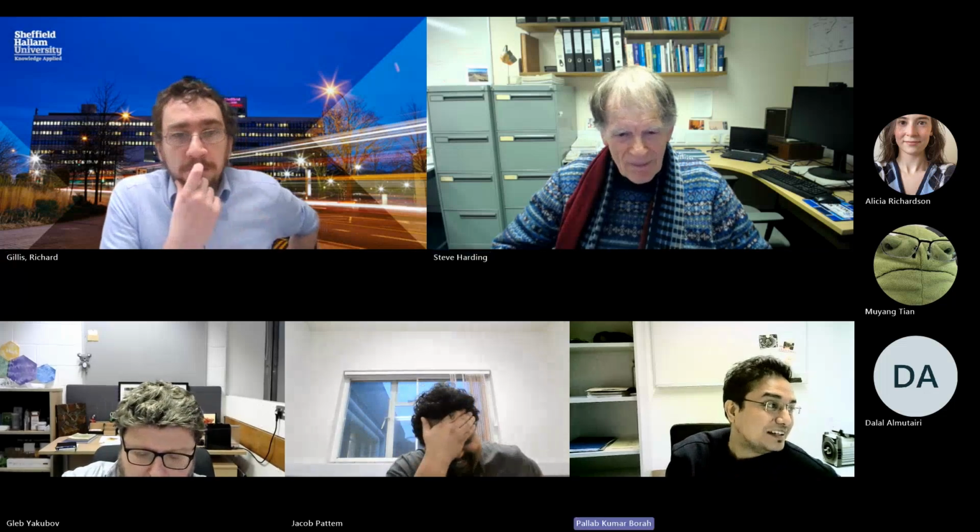Okay. Somebody has taken this title, MULTISIG2, on GitHub. Have they? But it's some financial app. Yeah, MULTISIG, it's some, because I got a random email from a banker going like, oh, you've got a publication of MULTISIG. I'll share the GitHub link. Yeah, I need to come up with a better name than MULTISIG2 then. Can't avoid it. You can't avoid it.